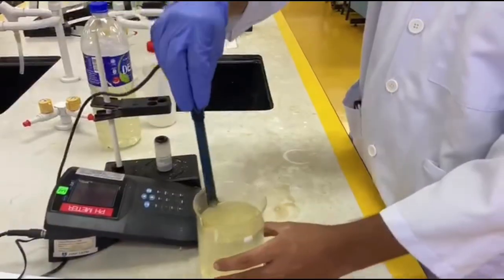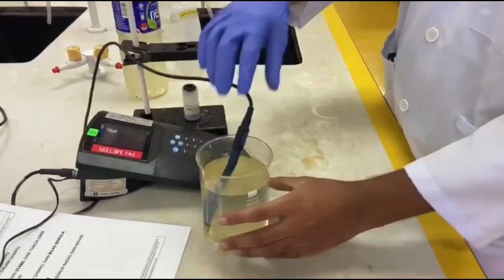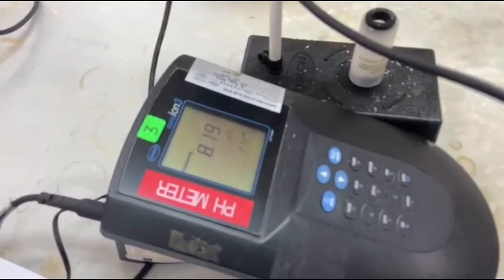Fifth step, wait for the reading to stabilize on the digital display. Sixth, record the pH value directly from the screen, and after use, rinse the probe again and store it properly.